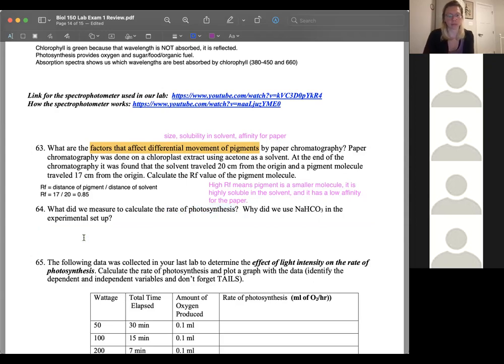Measure the volume of liquid expelled out of the pipette and divide by the time it took. Right, so we measured the movement of that water along the pipette over time.